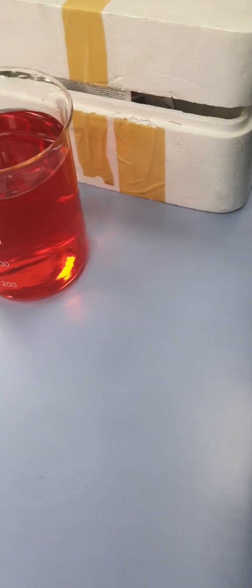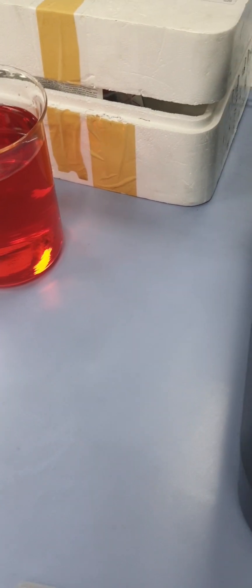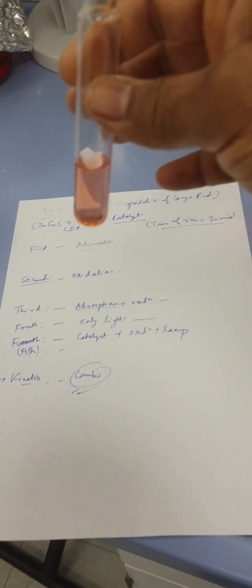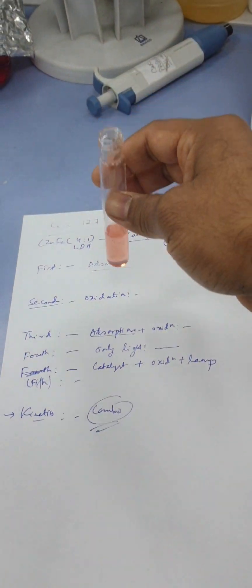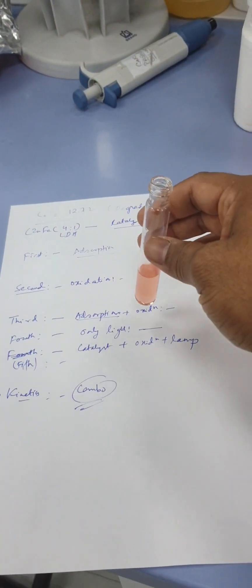We will check the concentration after half an hour. This is covered now. This is my sample after first set - adsorption, oxidation, adsorption plus oxidation.